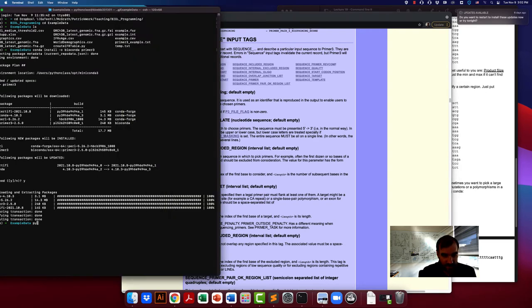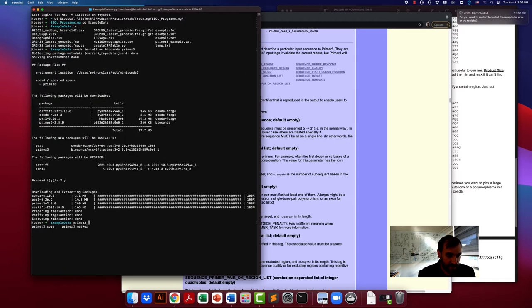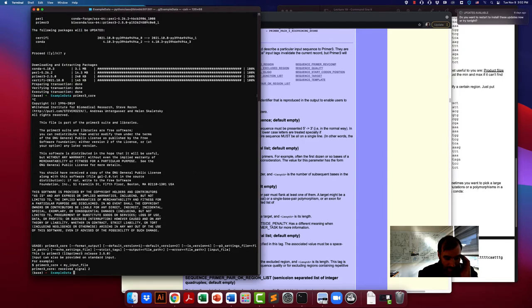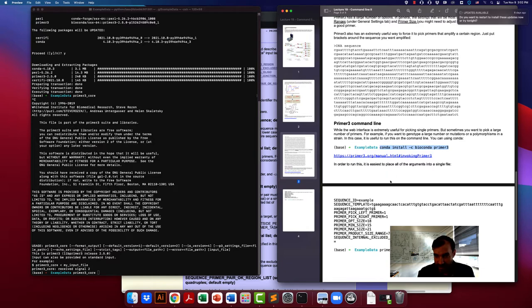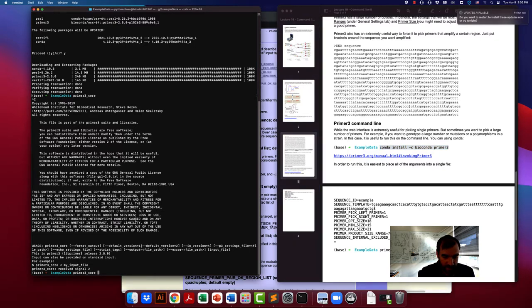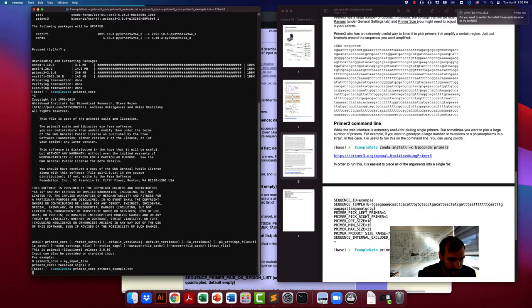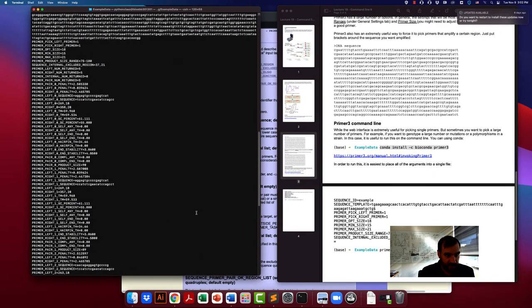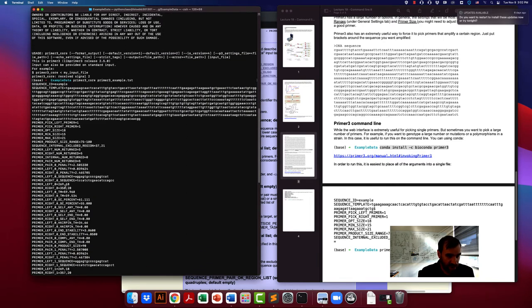The basics of how you run it: one important thing is that you have to know the name of the program. The name is not 'primer3' but it's actually 'primer3_core', so in order to run it you have to type primer3_core. The easiest way to run this is to give it a file that has the appropriate arguments, and we'll go over what those appropriate arguments are.